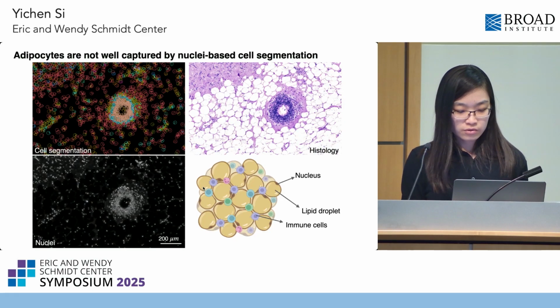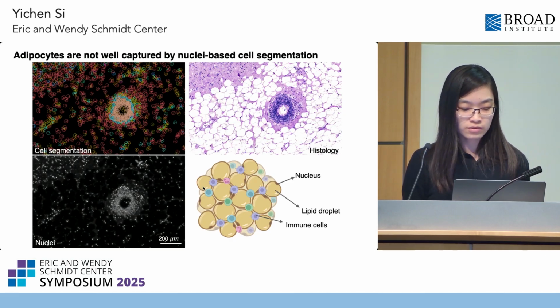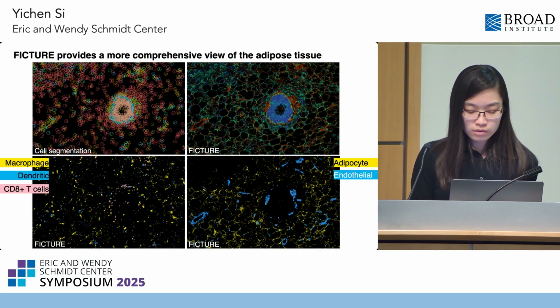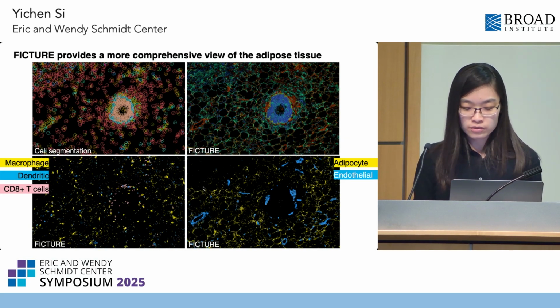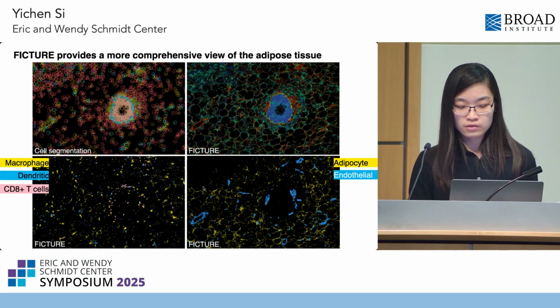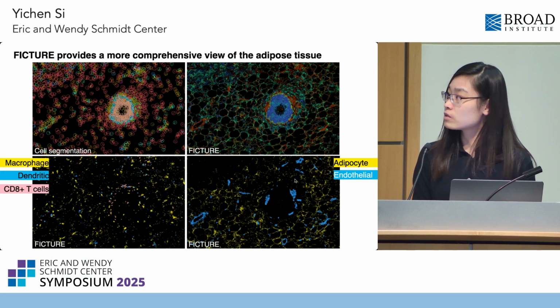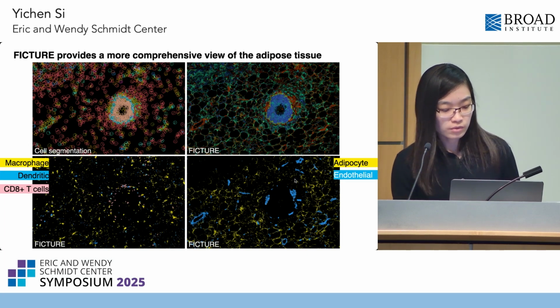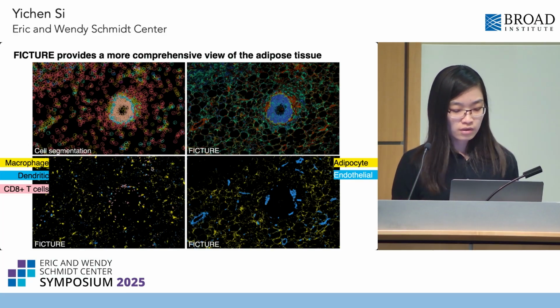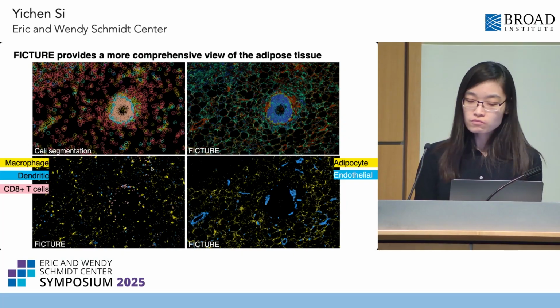The cell segmentation from Xenium from the 10x platform is quite misleading in this region because nuclei staining is just not very informative. So our approach is not affected by such cell morphology. The top right panel shows each pixel colored by our inferred factors. In the bottom one, we highlight adipocytes in yellow and endothelial cells in blue. We also identify different immune cell populations in this region. So overall, we provide a more realistic picture of the underlying biology.